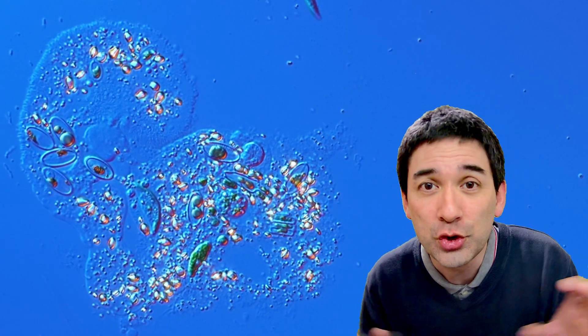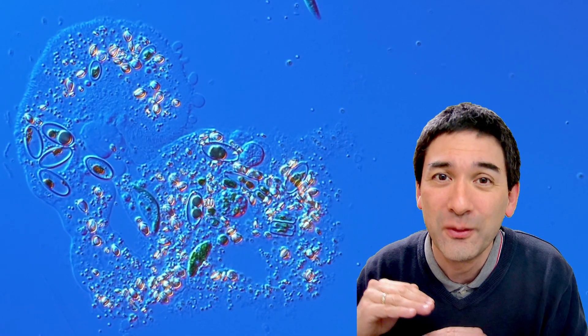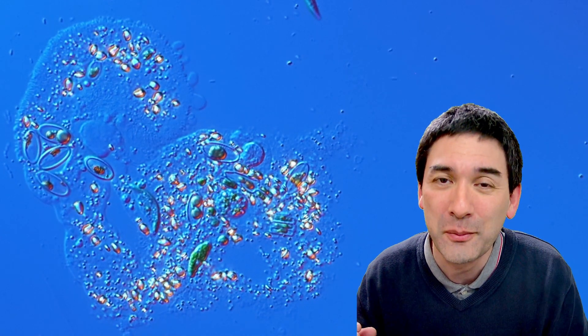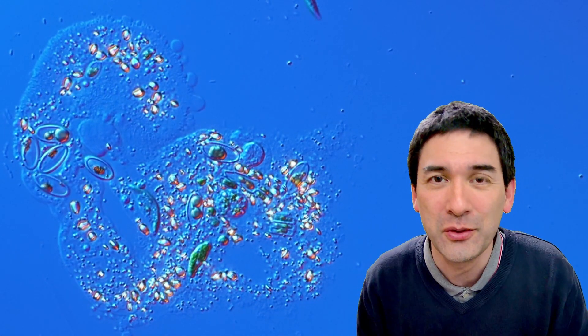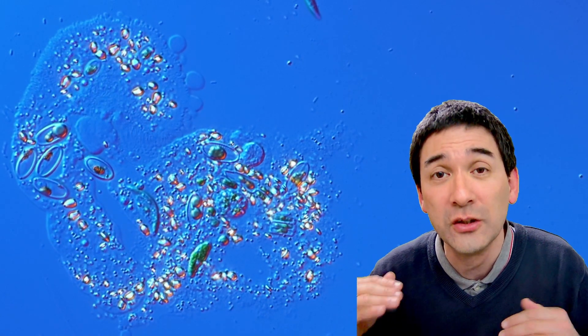But once you actually speed up the video, then you're able to see them changing the shape around. And then if you reduce the water by simply waiting for the water to evaporate from the microscope slide, well this is then when you're able to see things like this.